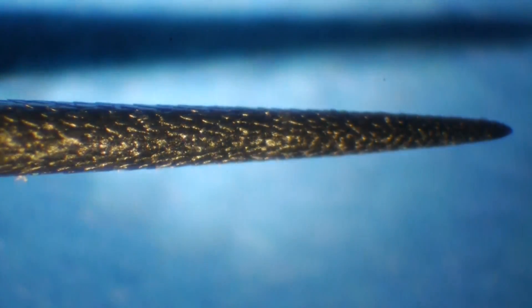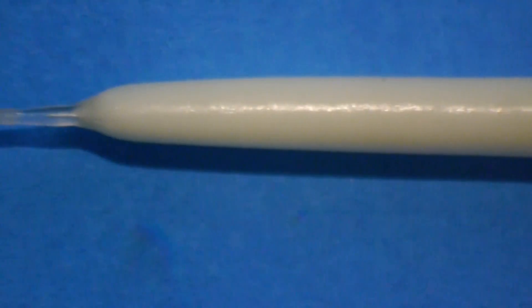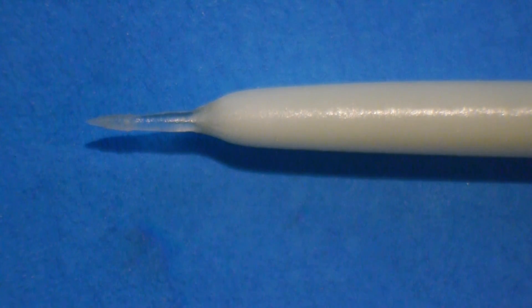Those scales point away from the tip, which makes them drive in more easily and makes them stick in, so that when the porcupine moves away the quill stays in that unfortunate animal and slips out of the porcupine. When we look at the roots, we notice that the root end is also tapered or pointed.